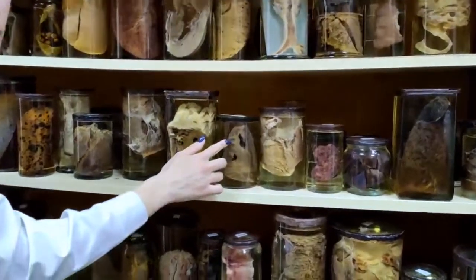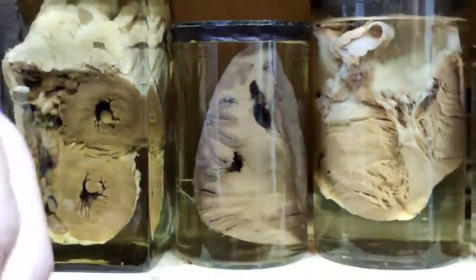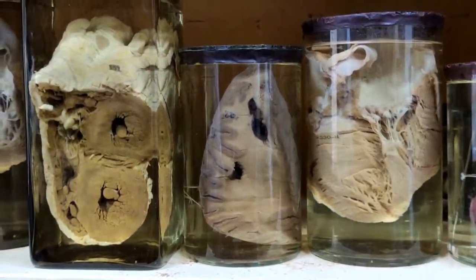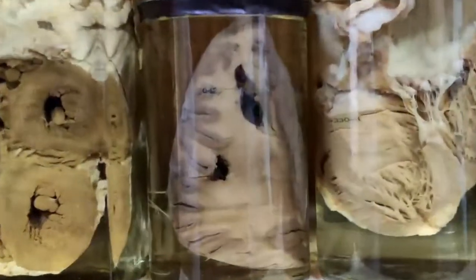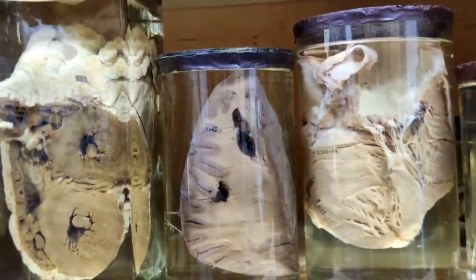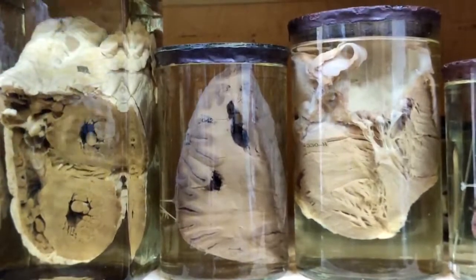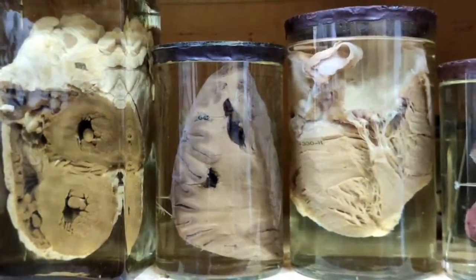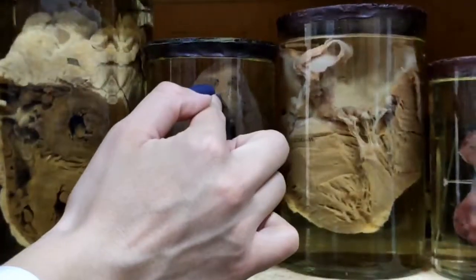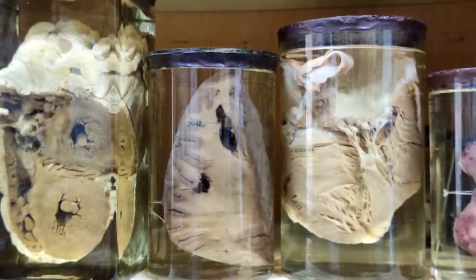The hematoma in the brain, or you can also meet the name brown cysts. When this hematoma is atrophy? No, brown atrophy is about the liver. But here we can see in the initial stages just accumulation of blood in the brain, but then when macrophages eat all these erythrocytes, we can see just cysts, and the wall of the cyst has a lot of hemosiderophages.